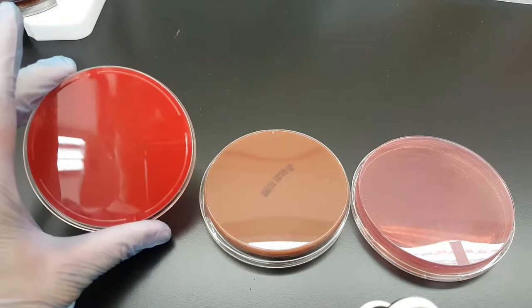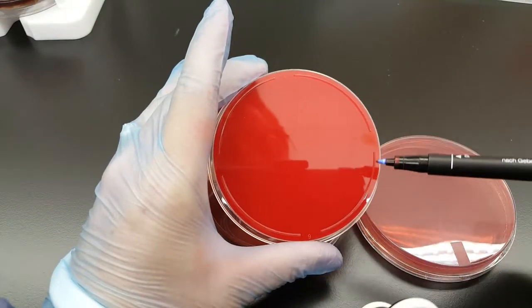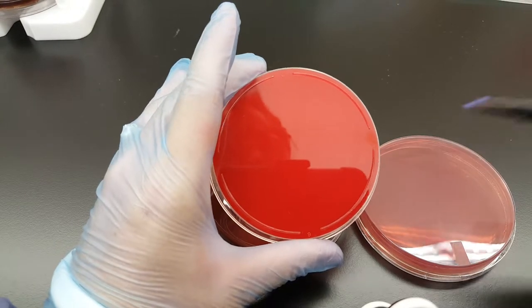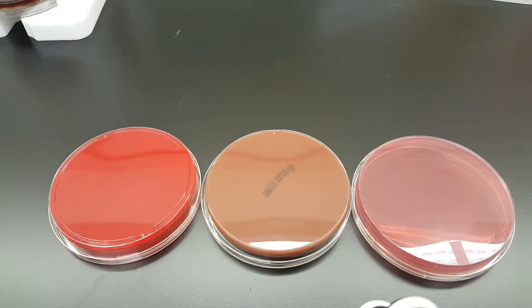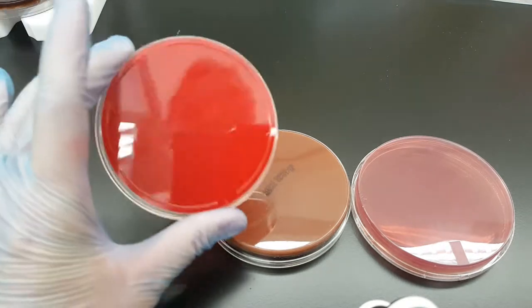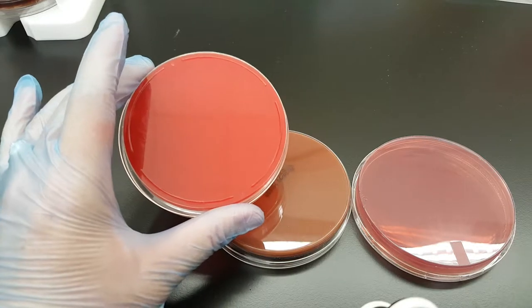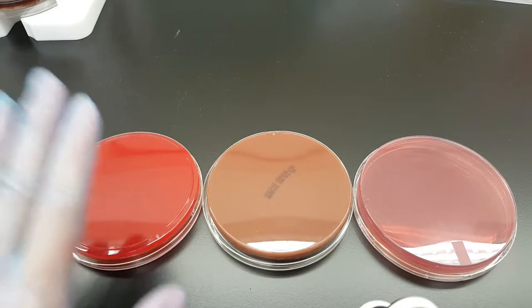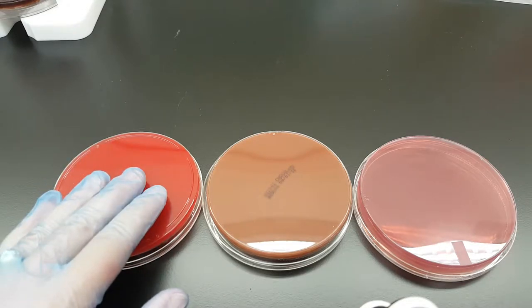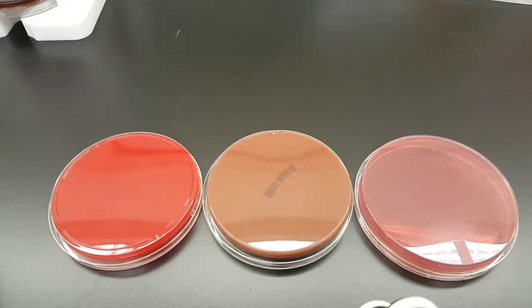We want to always mark around the rim of the back of the plate. The reason we don't mark the top of the plate is because tops can go missing or be separated when someone at the clinical facility is looking at them and deciding what an organism is. They might get mixed up, so we want to make sure that anything dealing with labeling the patient is going to be on the actual plate itself so it will never get separated from the organism.